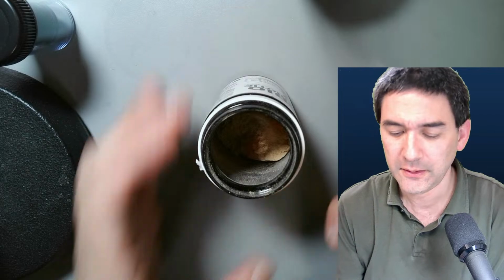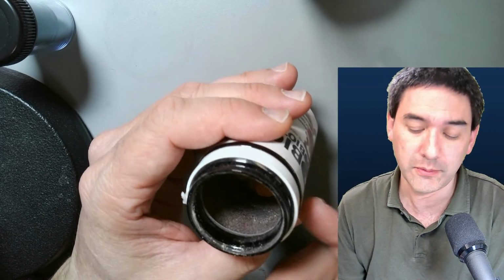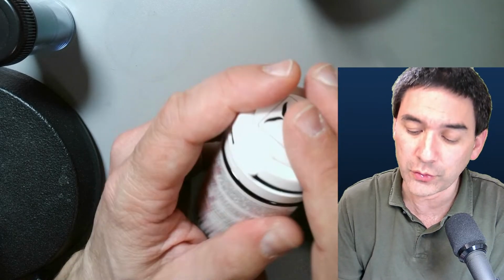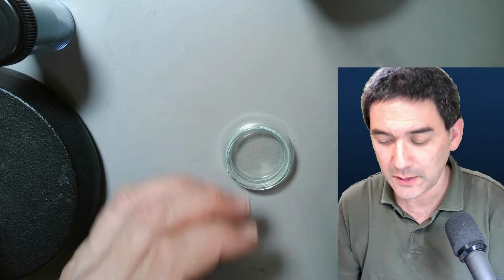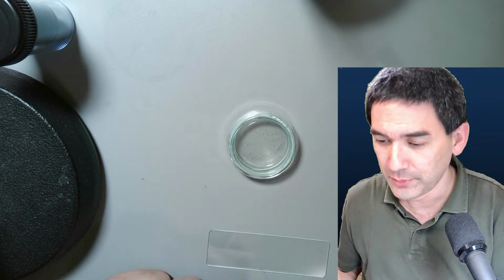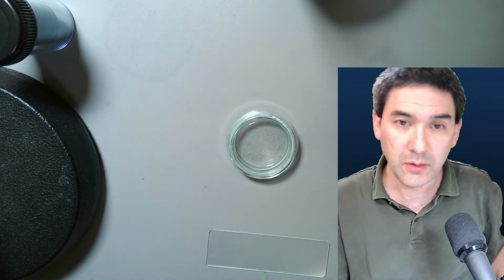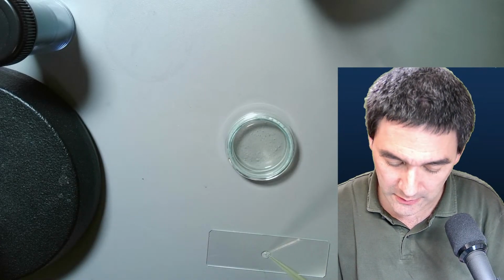Doesn't smell good, right? Basically these are bacterial cultures, pure bacteria, and what you do is you can add them to an aquarium and they then start reproducing. And what I have done is I've taken a few of those and dissolved them in water, because some people want to see bacteria, but not dangerous ones. So I've put them in here, and I'm going to take a small sample and put it on here as well.